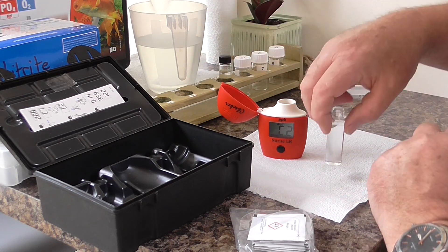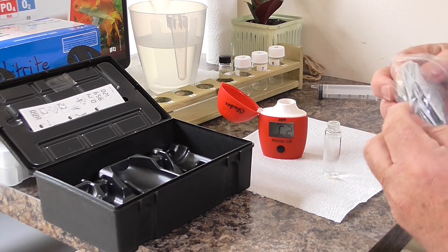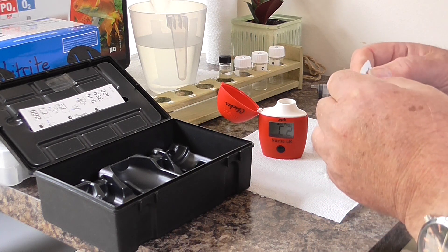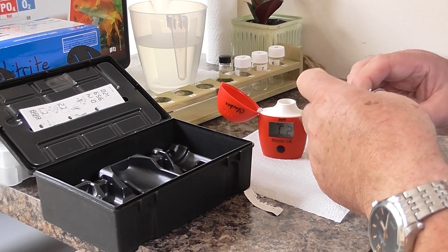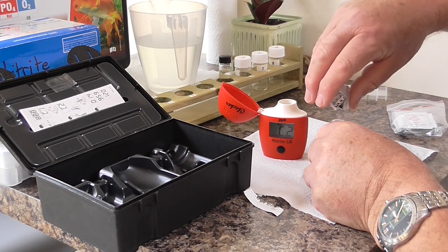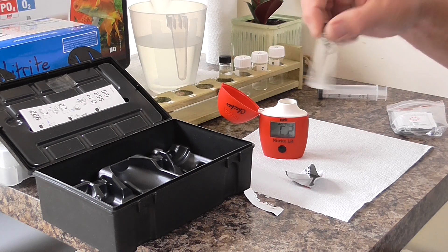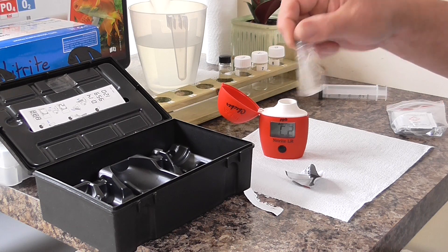Take the pond water out, and open up a sachet of reagent and tip it into the test tube with your 10 millilitres of water. Shake for about 15 seconds — I said 15 minutes but I'd be a bit tired shaking for 15 minutes!